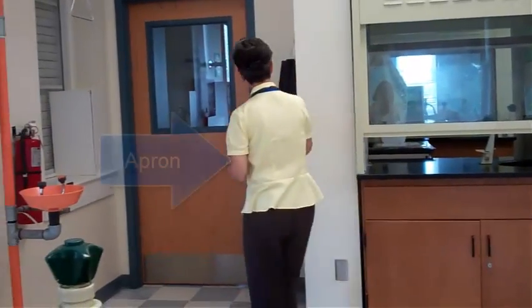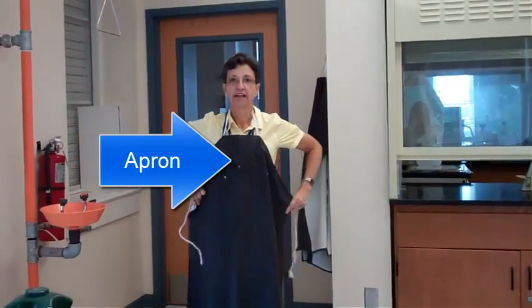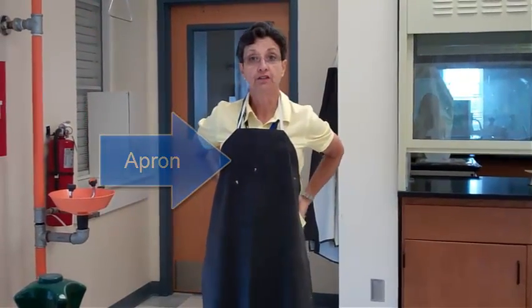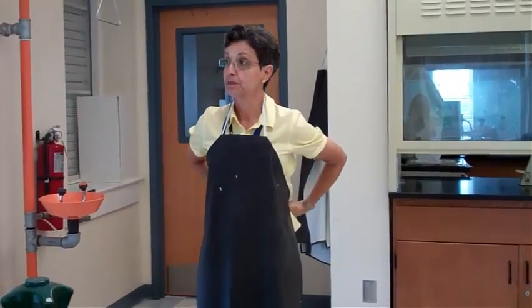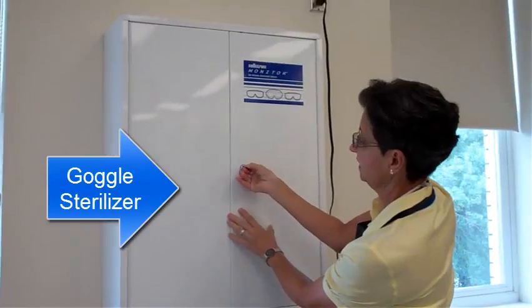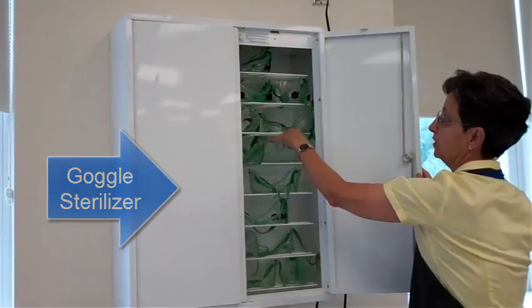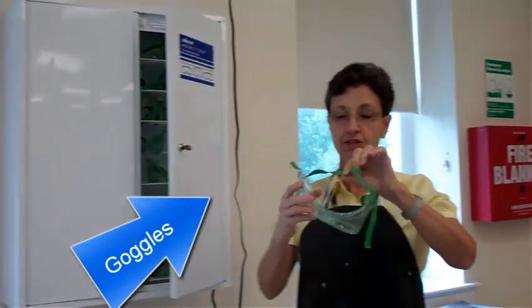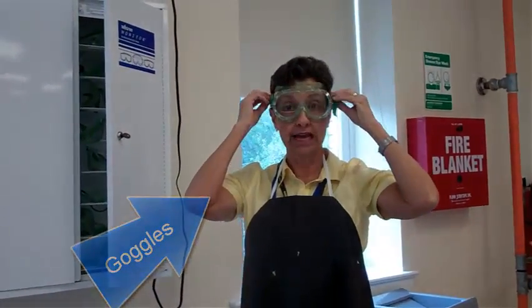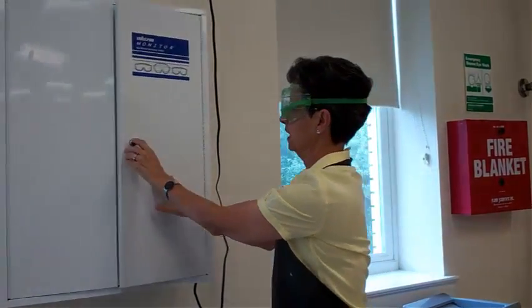When you walk into the lab, the first thing you're going to do is find an apron for yourself. You're going to put it on and tie it, and then move on to the goggle sterilizer, which is right here. You will take a pair of goggles from inside and put them over your glasses if you're wearing glasses. If you're not wearing glasses, you can pick any one of the goggles there.